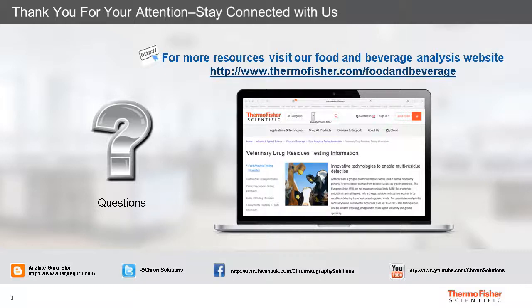Okay, thank you, Richard. And the next question is for Fausto. I need to analyze polar pesticides, but only a low number of samples. So I would like to know what other applications are also possible by IC-MS. Thank you.